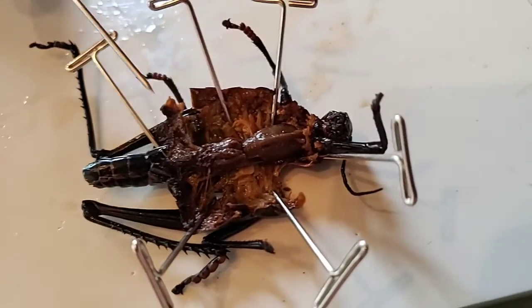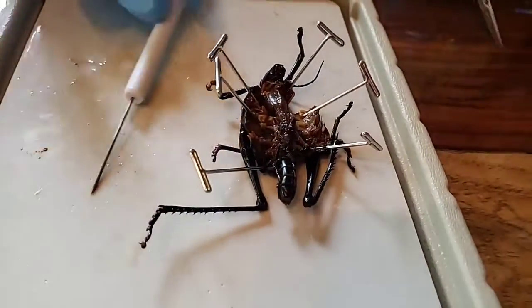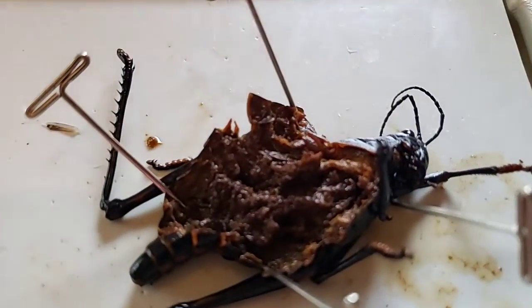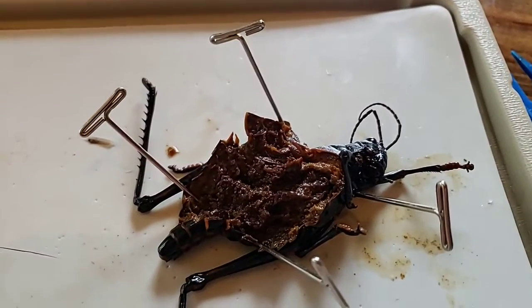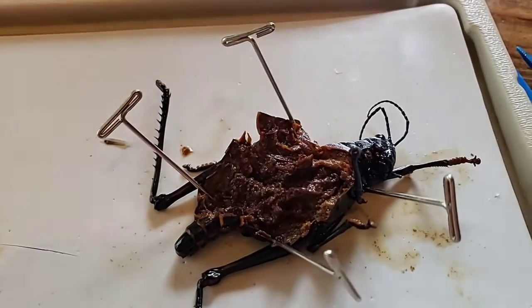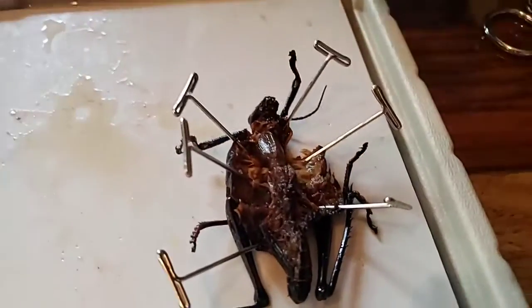Okay, number 10. Identify the reproductive organs that lie on either side of the abdominal digestive organs. So, Tanley, you might need to cut open your abdomen a little bit more so that we can see that. Let's go look at mine. I'm going to show you a picture of Lanston's right now. This is what happens when a specimen doesn't get preserved well: all of its organs just turn to mush. So we're going to come back to Tanley's because it looks much better. Her organs were preserved well.